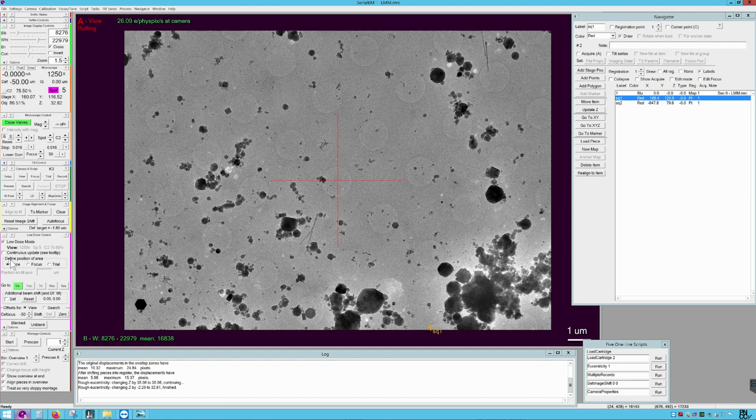And so I will do that in Low Dose control, define position of area, click focus. You see the field of view of the camera as a green box, and then the yellow is the focus position. I can focus between holes on the carbon foil. So any of these positions are correct, but I should choose one where there isn't transfer contamination. So I'll just go straight above to this area. I want to give some distance between the hole and this image in this focus position. This looks good.